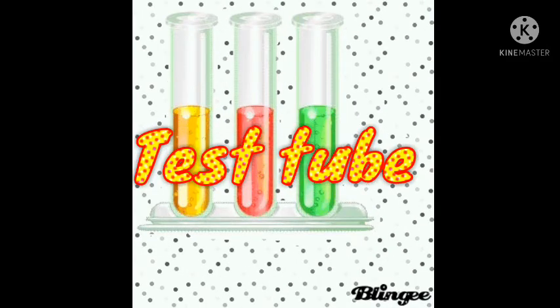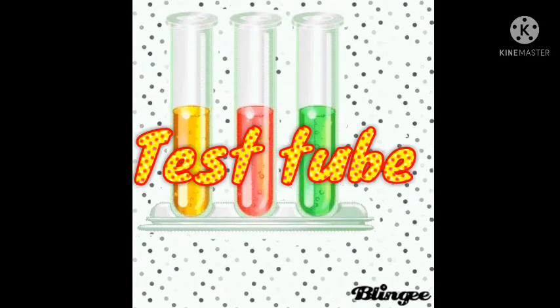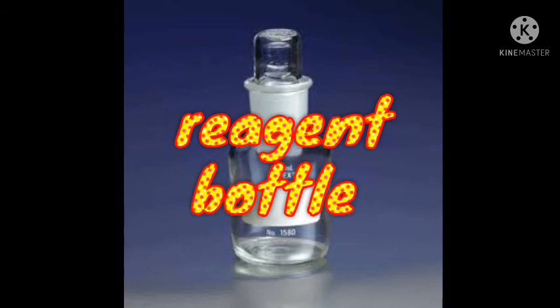Test tubes are used to hold chemicals during experiments, for example, holding a corrosive chemical like acid. Next, we have the test tube rack. The test tube rack is a piece of laboratory equipment used to hold multiple test tubes upright at the same time. Next, reagent bottles are used to store chemicals in liquid or powder form.